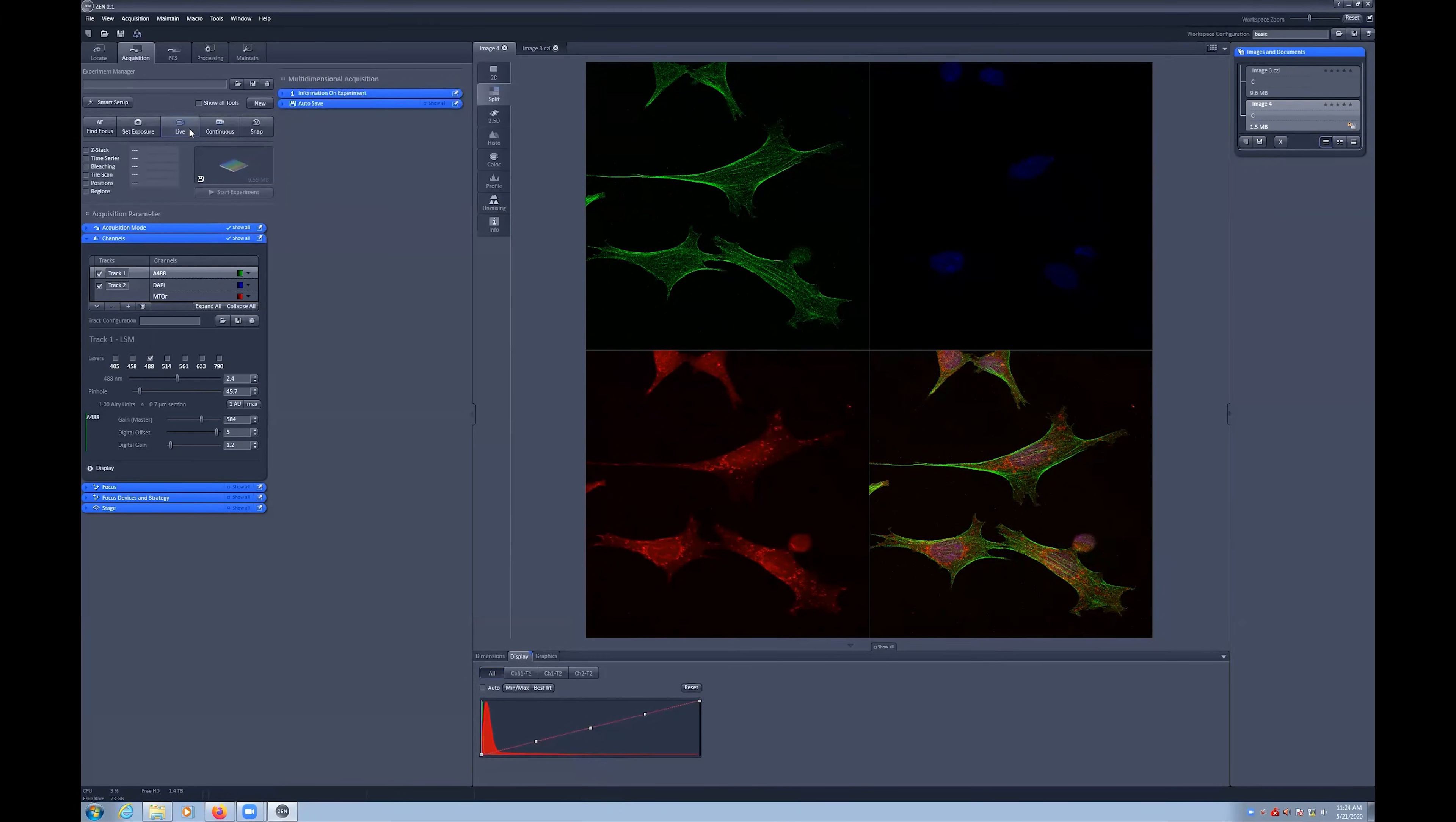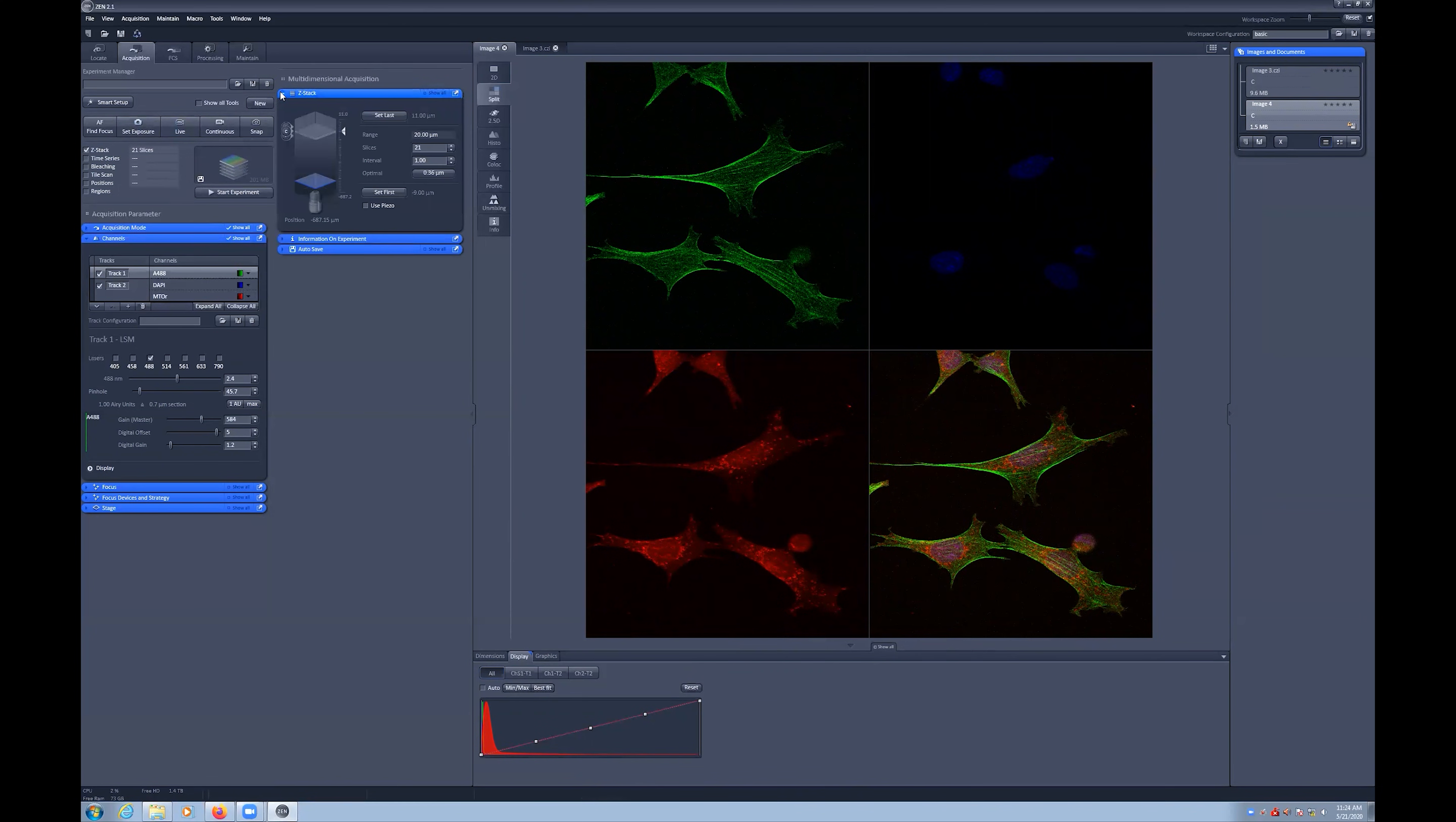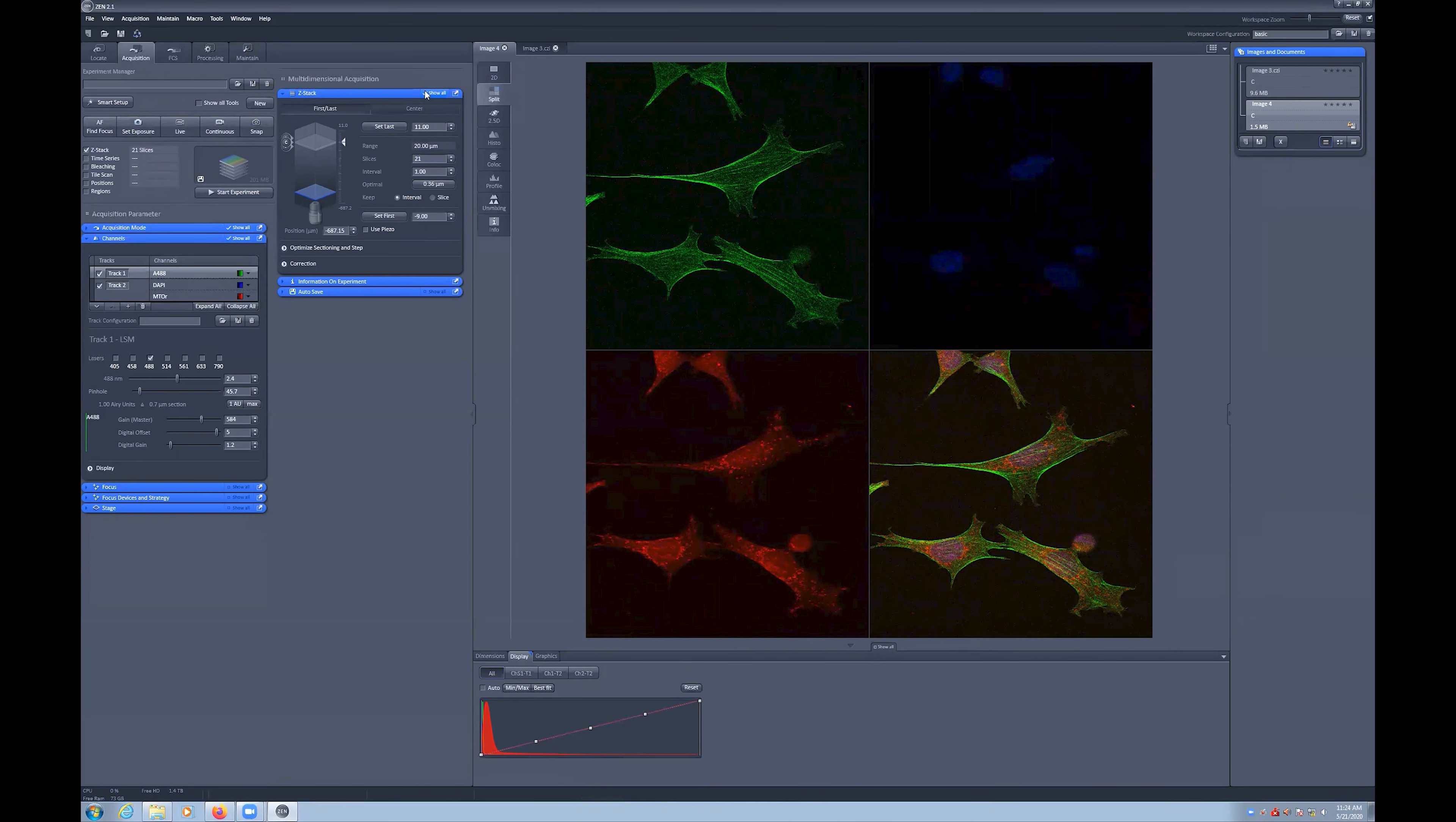To begin, select the Z-Stack tick box to turn on this multi-dimensional acquisition mode. You will see that the Z-Stack menu will appear within the software. You can then expand this and tick the Show All Tools button.